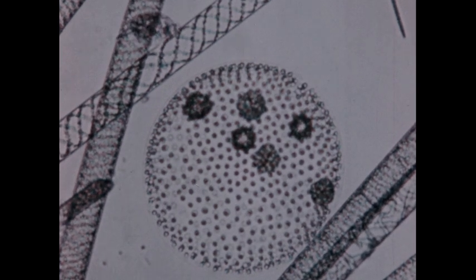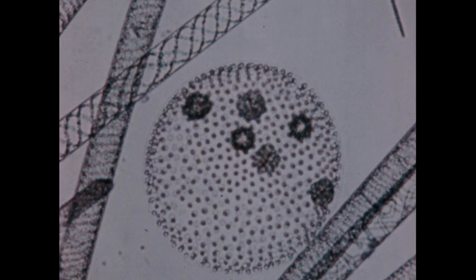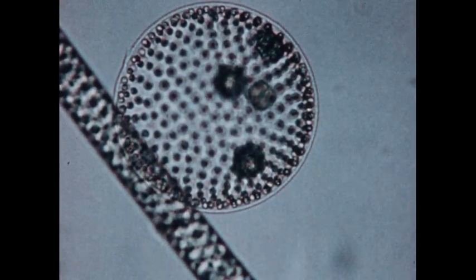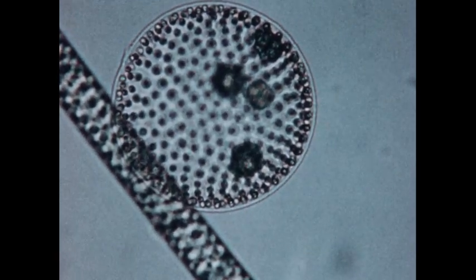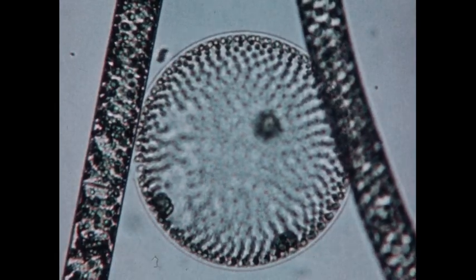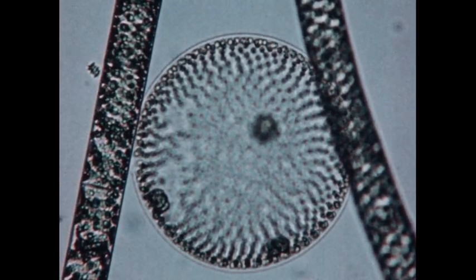The round object surrounded by Spirogyra is Volvox. Volvox, like Spirogyra, has chlorophyll, but like amoeba or any typical animal, it moves about. Volvox is really a colony of thousands of single-celled plant animals called protists. Each cell has two small whips of protoplasm, or flagella, which lash about, rolling the colony over and over.